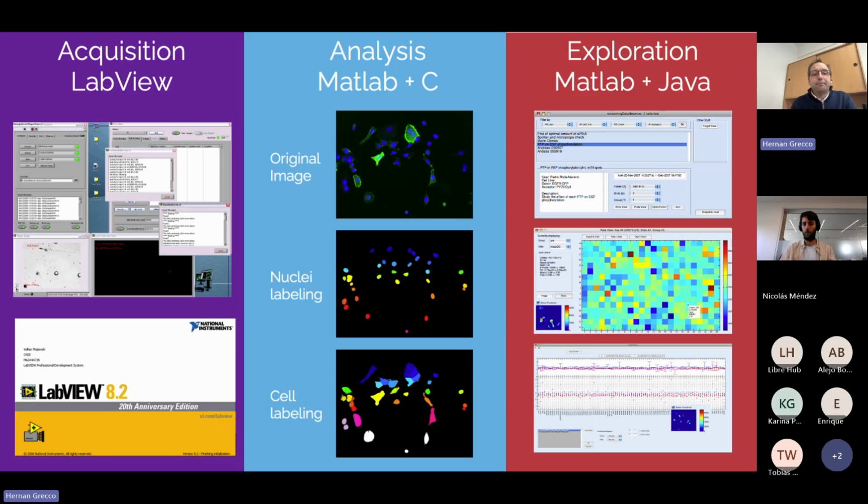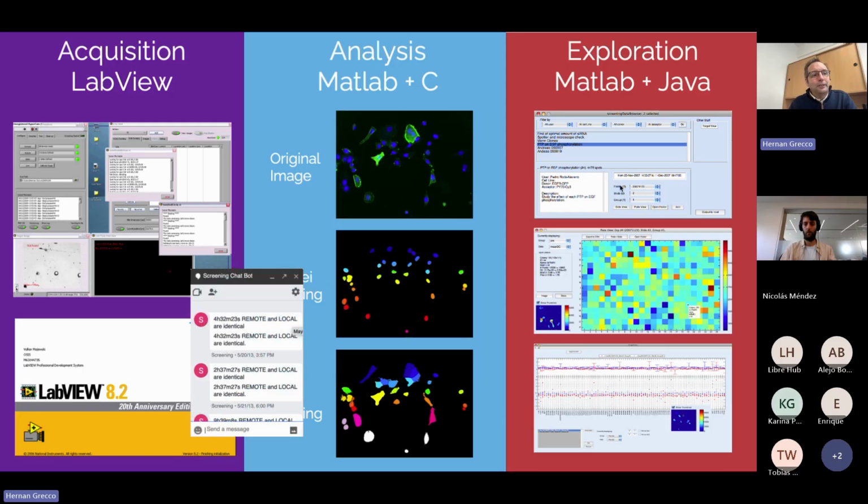And also on top of that, the Max Planck had a very strict VPN at that moment in the institute. And therefore, in order to know the status of the microscope from outside the lab, I built a chatbot using Gmail chat at that moment that was telling me what the status was, how many hours were still missing, and so on and so forth.